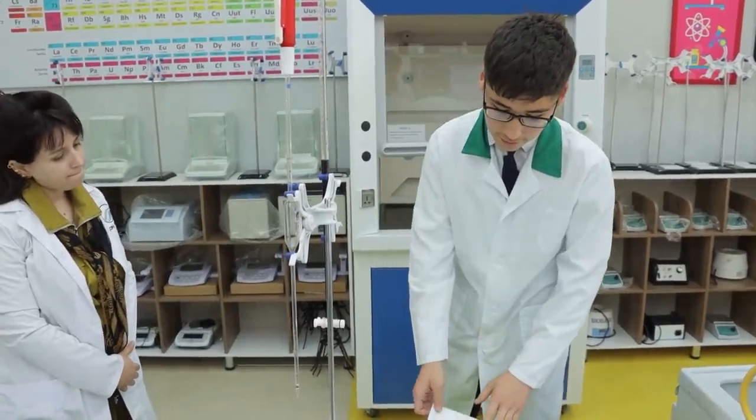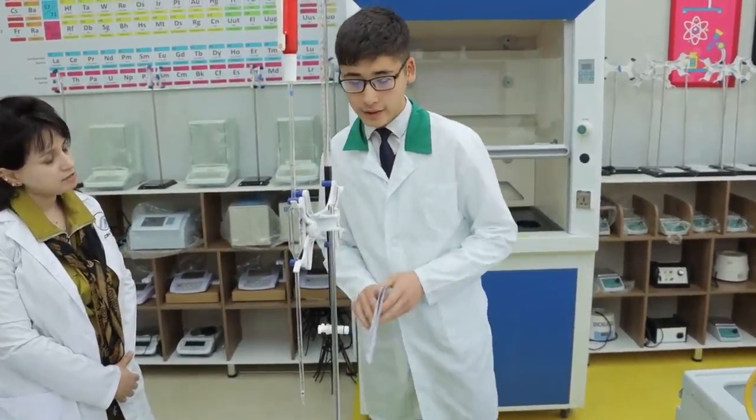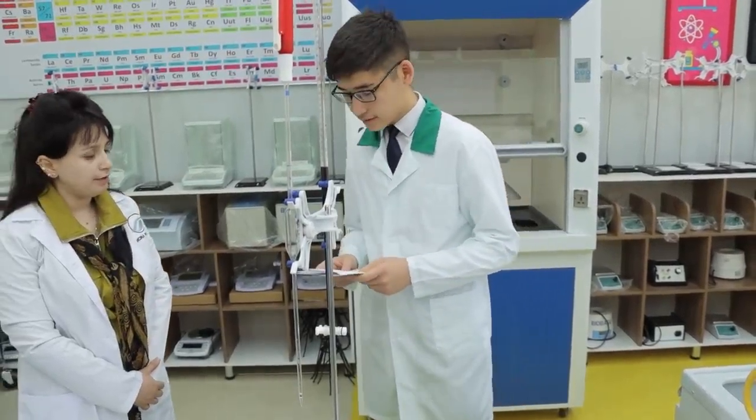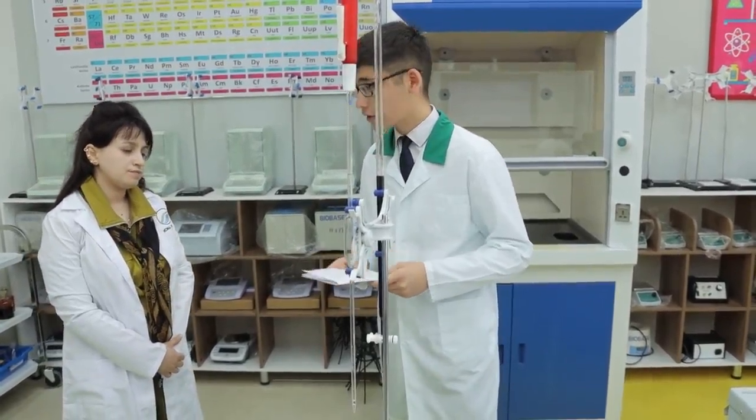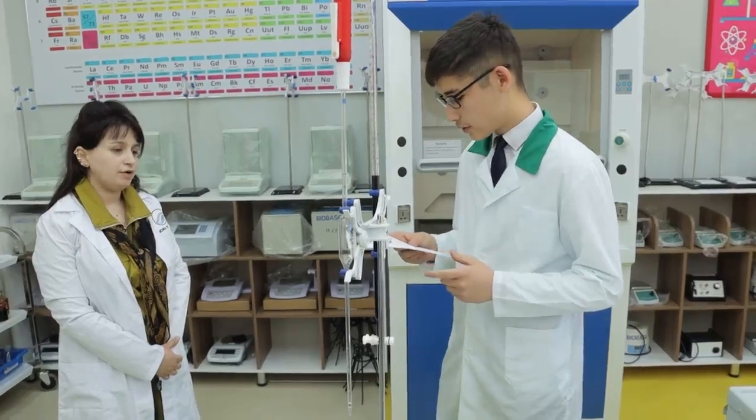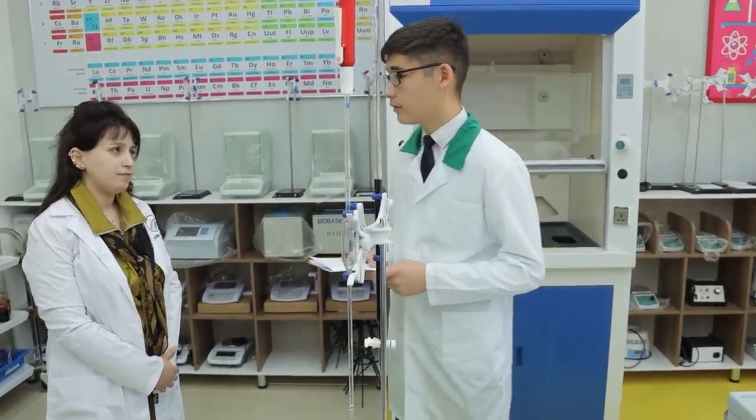We conducted several methods to find it. Several titrations you carried out. Yes. Okay. We made quantitative analysis, and at the end we got the concentration of the hydrogen peroxide, which was 1.54. That's very good. Okay.